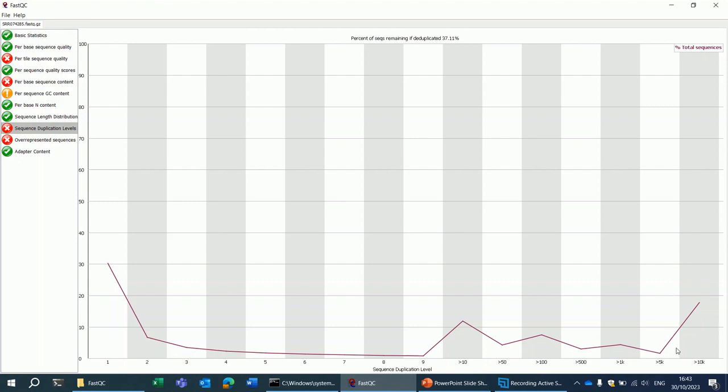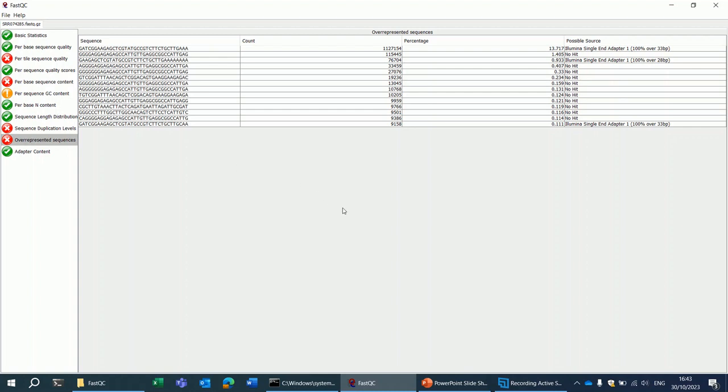So as I said before here, this peak is important. When you see a big peak here at the utmost right of the plot, it points to contamination. How can you check the contamination? Well, for that, you go here to the overrepresented sequences table.